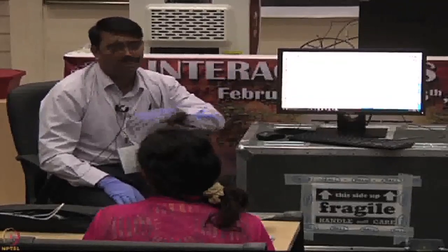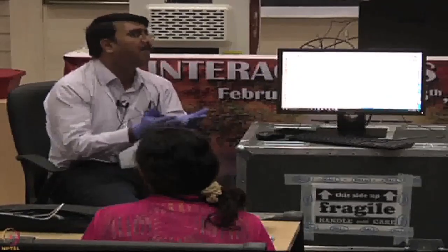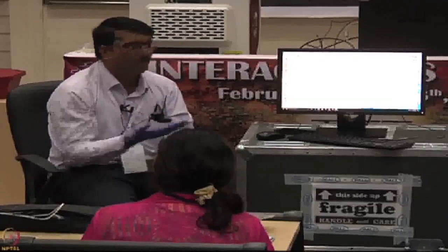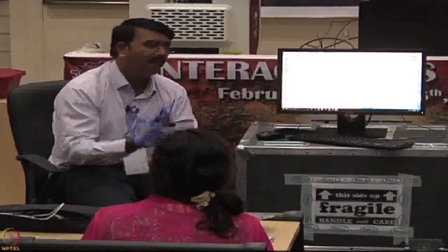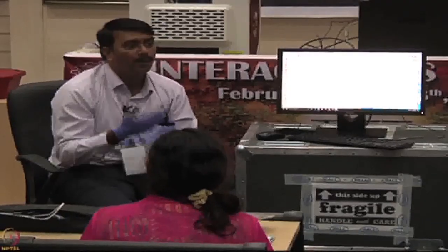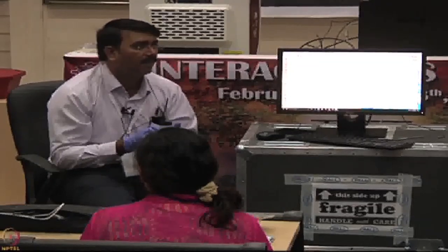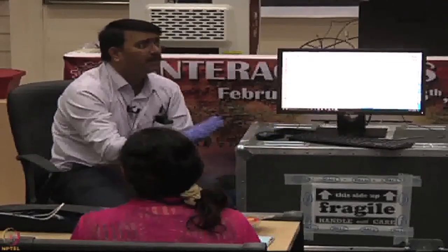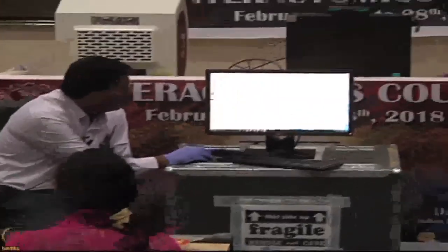During the hydration time, whether your sample plate has to be in the shaking condition. I mentioned it is not fluidics based, it works on dip and read. Generally not. What happens is, during the waiting period if you are shaking, protein has a tendency to aggregate. There's a possibility. Generally, we do not advise that. Okay, then I will uncheck this. Only during experiments we require shaking. During hydration, not required.